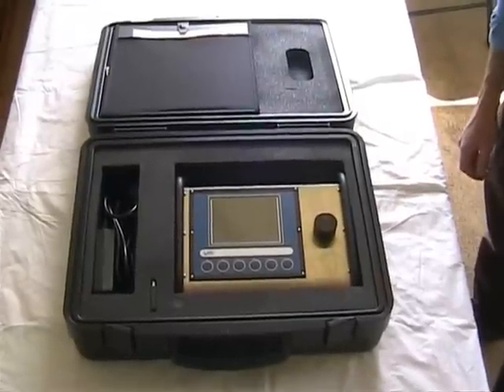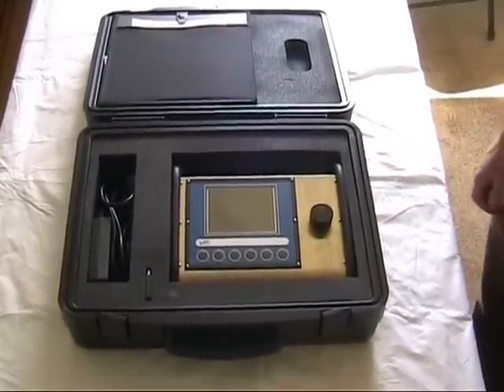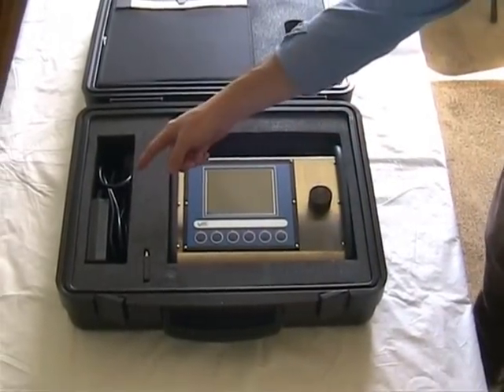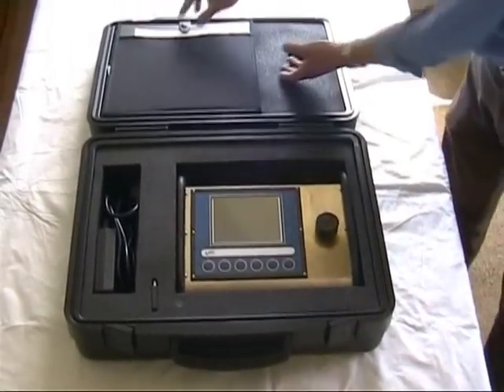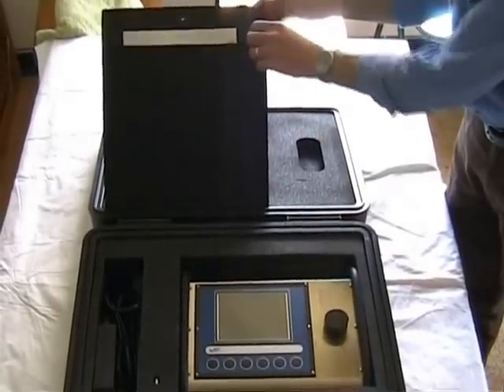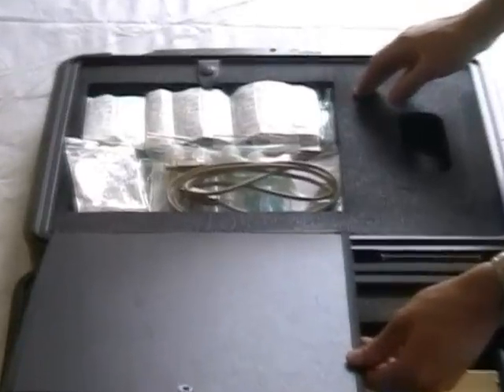The Mirus analyzer comes in its own carry case, which holds the analyzer, the wireless mouse, the power pack. It has a document pouch for the user guide. Space for consumables like cleaning solution and syringes.